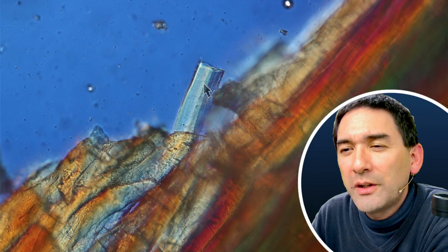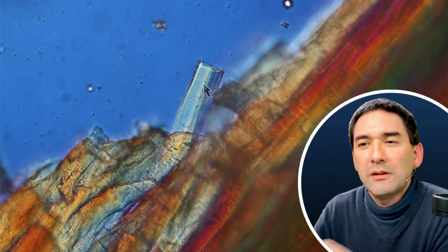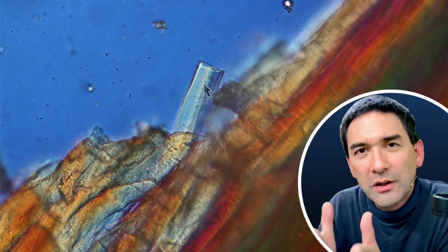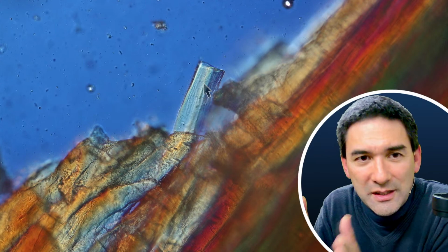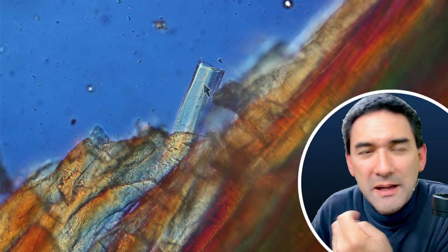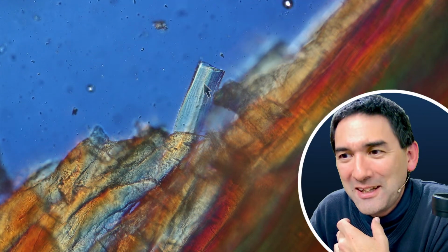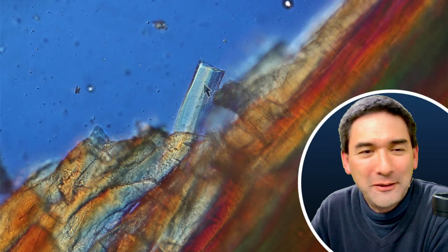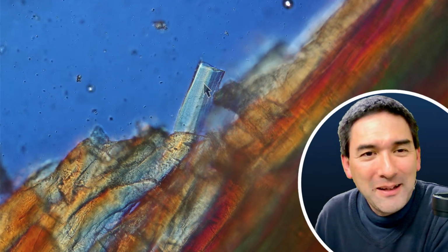Are these the sarcomere stripes? Yes, exactly. So these are basically the light and the dark bands of the sarcomere, and the sarcomeres are the contractile units of skeletal muscle. Okay, so that's basically what I was hoping to be able to see, and I was able to show it to you. It's a little bit of an add-on.